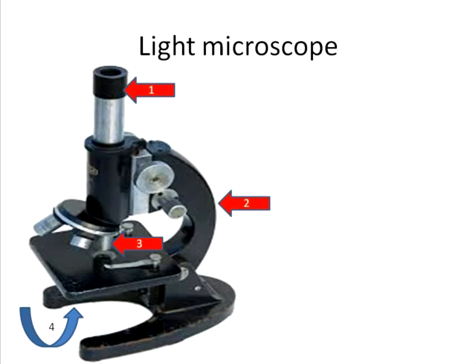Here in this picture, where you see a light microscope, the part marked 1 is the eyepiece, wherein you put your eye to see it, and then 2 is the handle, and 3, there are actually 3 lenses, 3 lens systems. They are called the objective lens system. Now 1 and 3, that is the eyepiece and the objective lenses, magnify any object which is smeared on a slide and put on the stage.